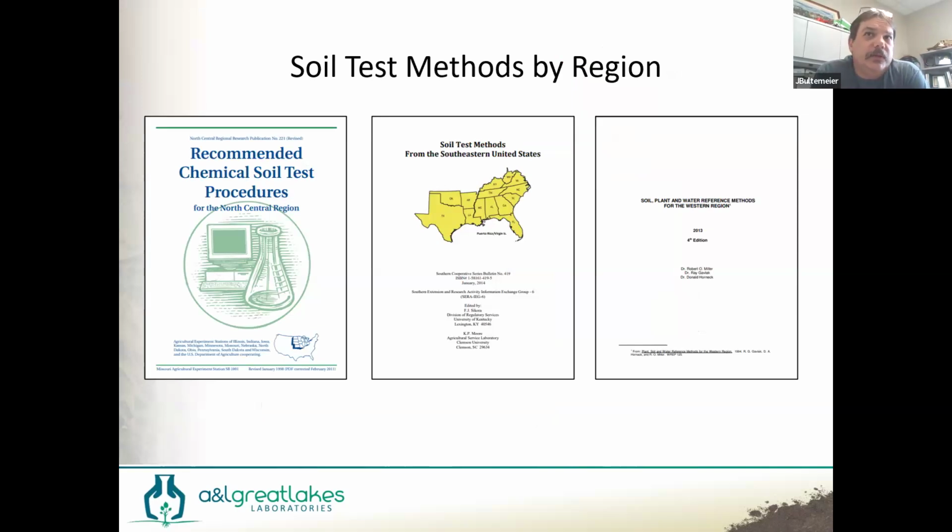So what we do at the laboratory, we're not certified. There isn't like a government agency that oversees us. We completely voluntarily regulate ourselves, and it actually works quite well. There's a twofold way we do that. First off is called the Method Reference books. So I'm going to share with you, the Soil Science Society of America has put out this lovely book. I think 95 is the last version of it. This is part 5. There's 7 books in the series. This one's for chemical extractions.